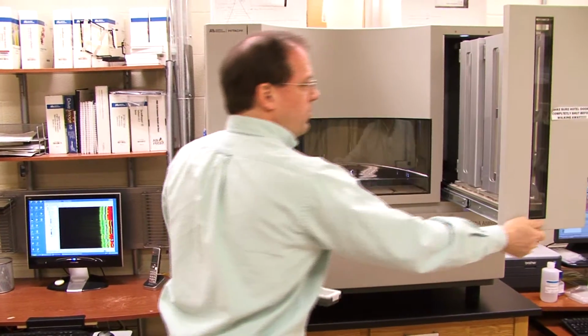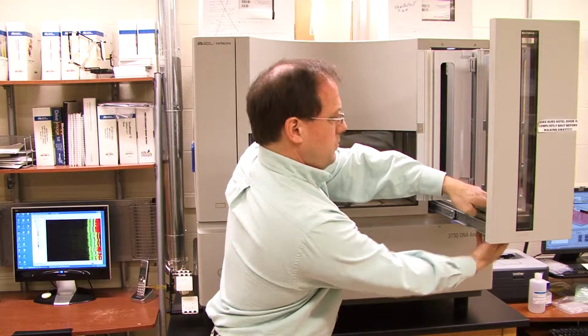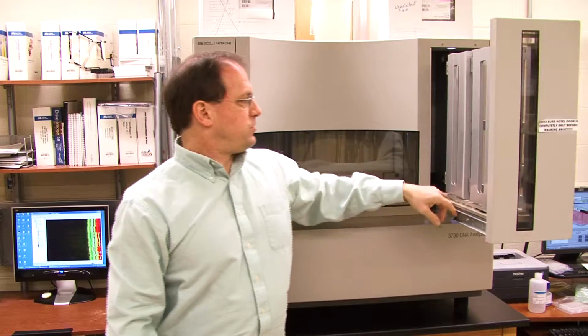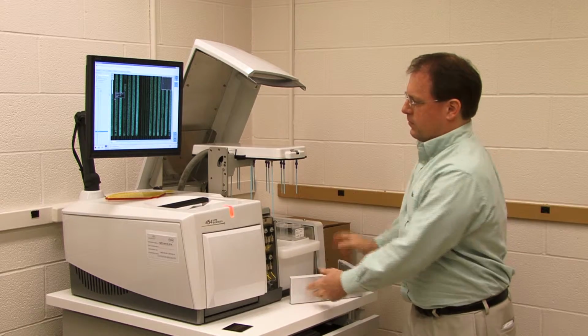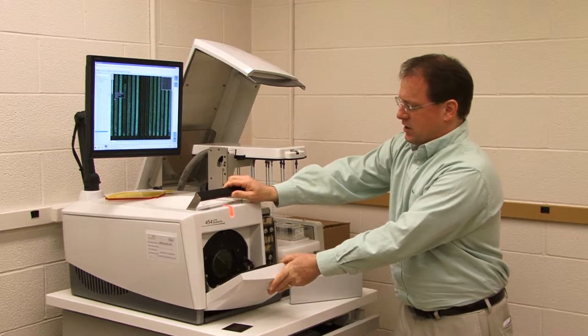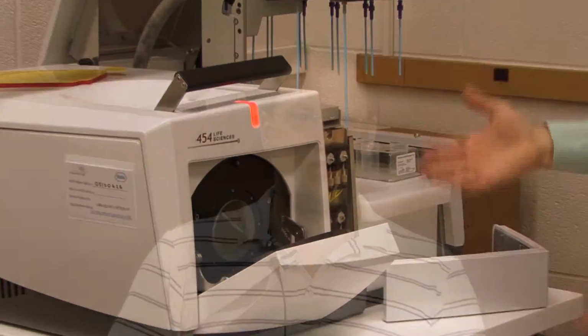PMGF uses a variety of instruments to serve their customers. An Applied Biosystems 3730 DNA analyzer is a workhorse for them, but a recent purchase gives them a state-of-the-art instrument. It's a Roche 454 genome sequencer, whereas our 3730 can generate about 400 sequences in a day. This one can generate 1 million sequences in a day. Now I take that back, 2 million sequences in a day. We can do 2 runs in a day on this if we wanted to. So that's the kind of yield that's going up in these instruments. It's a rapidly changing field as far as instrumentation goes, and it's important to stay with it to keep OSU competitive.